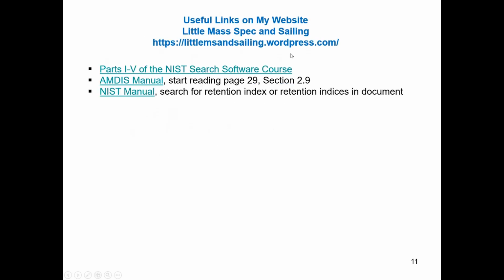There'll be a lot of useful things on my website, and the useful links I have put below. This is actually part of the handout, and the links will be active in the handout on the website. Parts 1 through 5 of the NIST search software course will be very useful. The AMDIS manual, if you start reading on page 29, section 2.9, there's a lot of information on how to use retention indices and to calibrate in there also. The NIST manual has a lot of information about retention index or retention indices in the document. You just need to search for it using the search command.